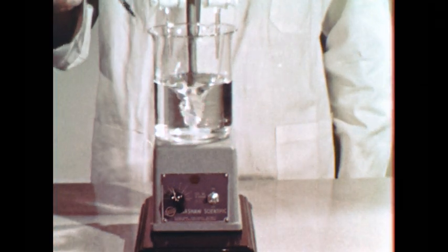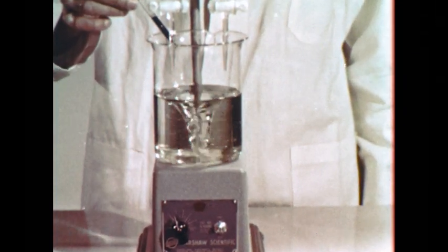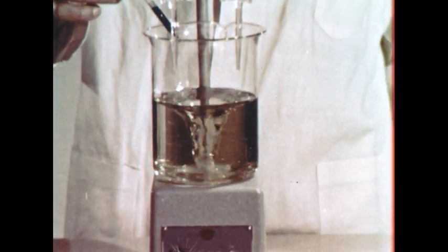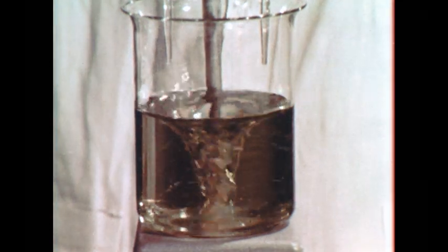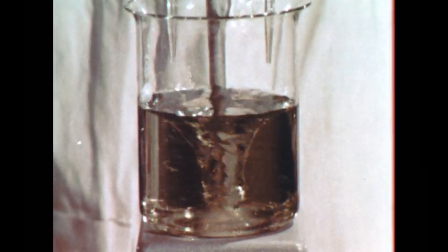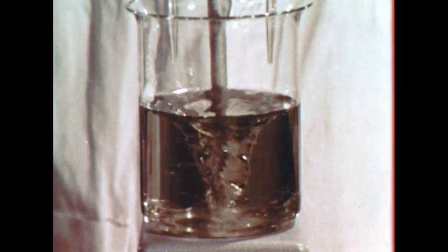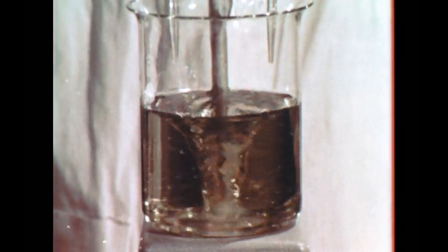A beaker of water is placed on a magnetic stirrer, and some of our universal indicator is added. The hydrogen ion concentration in water is about 10 to the minus 7th molar. So in this mixture, the phenolphthalein is colorless, the bromothymol blue is partly blue and partly yellow, and the other indicators are yellow, giving this total color.